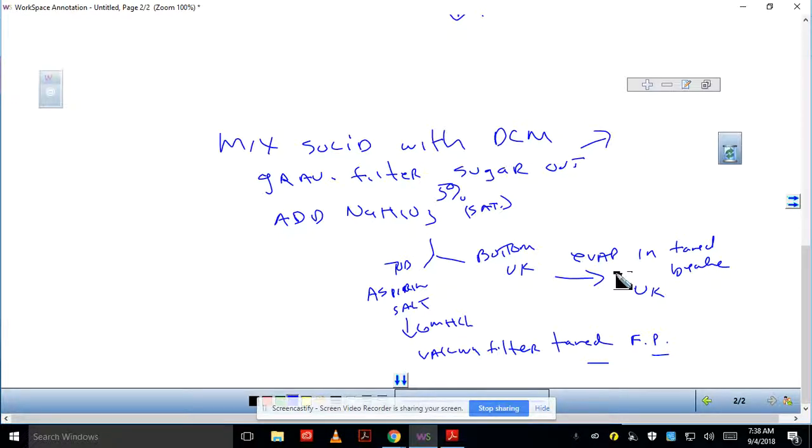So make sure you go out on the website or on the Canvas site, and you watch the videos on how to use a separatory funnel and how to use fluted filter paper. It's hard to say in one breath.